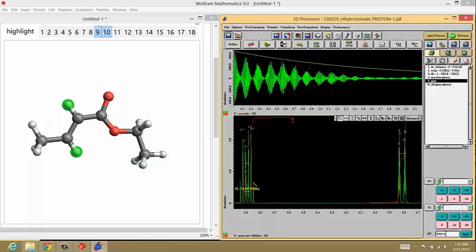And so it's the investigation of the coupling constants that allows us to differentiate between these two features. When we look at the two-dimensional COSY experiments, we are going to be able to analyze this feature in a much easier fashion, but we'll save that for a new tutorial.